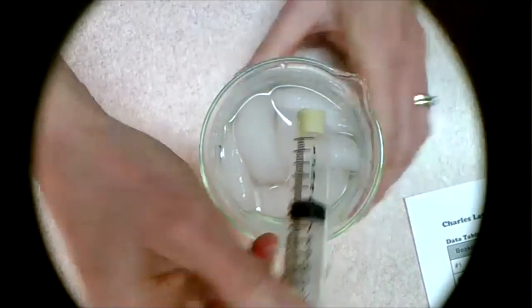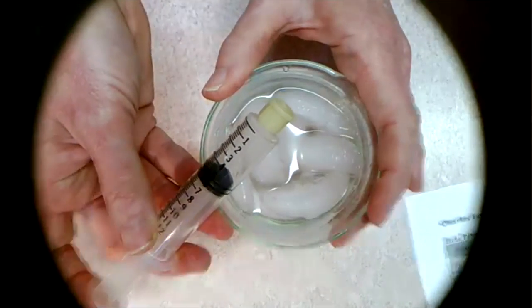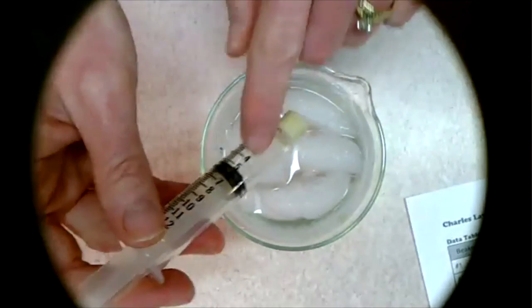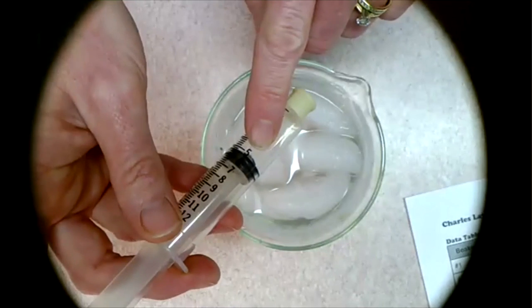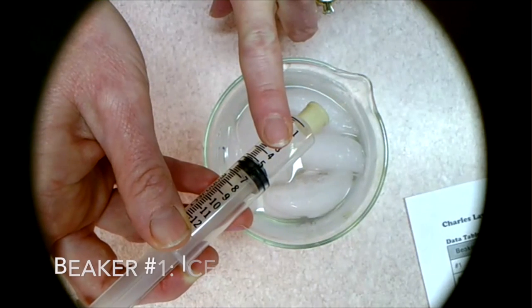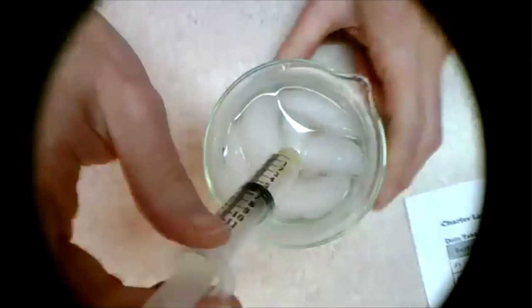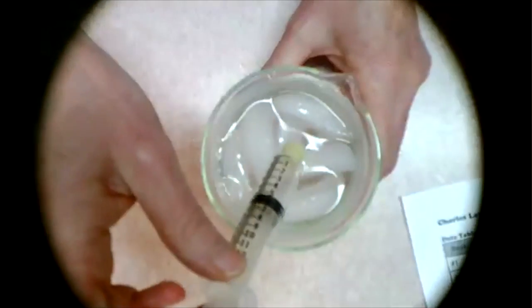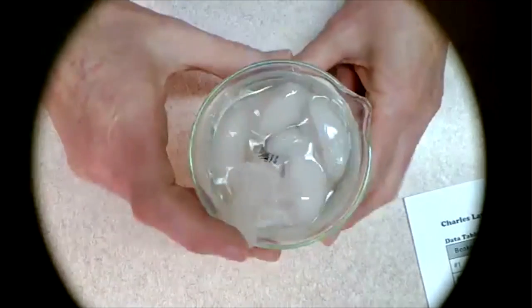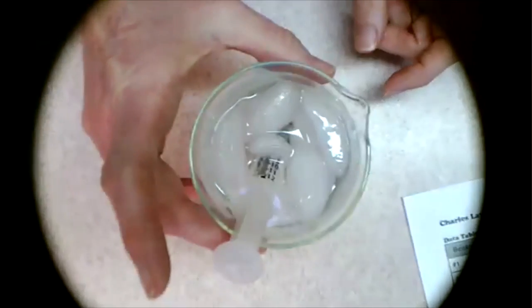Looking to see if I put this in here in the cold ice water, what happens to the volume, right? And what would be the prediction? Somebody answer. It would shrink. It would go down. Yeah, it would shrink or go down. So we're compressing it by putting it in here. So I'm gonna put it in here. We're gonna let it set while we do the other lab so it can get to equilibrium with the water.